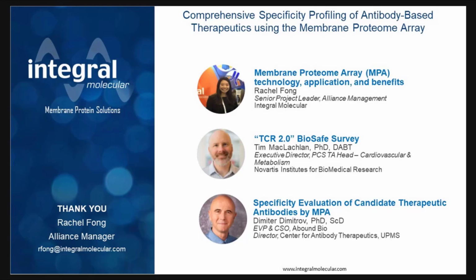Perfect. Thank you. This question is for you, Rachel, from David. Is it also possible to screen non-antibody binders, for example, novel protein scaffolds that may be as small as 10 kilodaltons, in a comparative analysis to MAb controls?